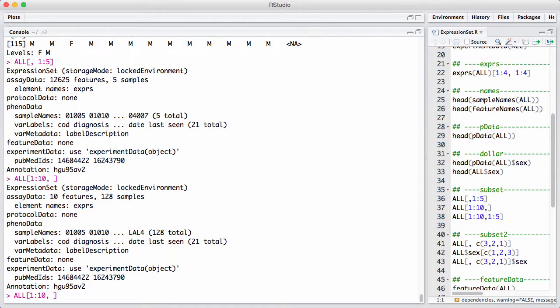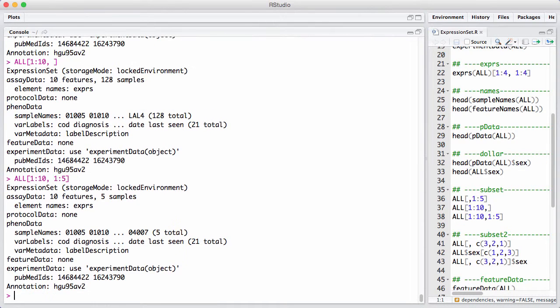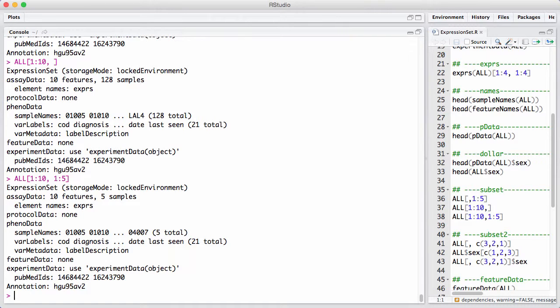And I can, of course, subset on both things simultaneously. Then I get a small data set back. This means that the expression set is closed under subsetting. When we subset the expression set, we get another expression set. And this is a very useful feature.